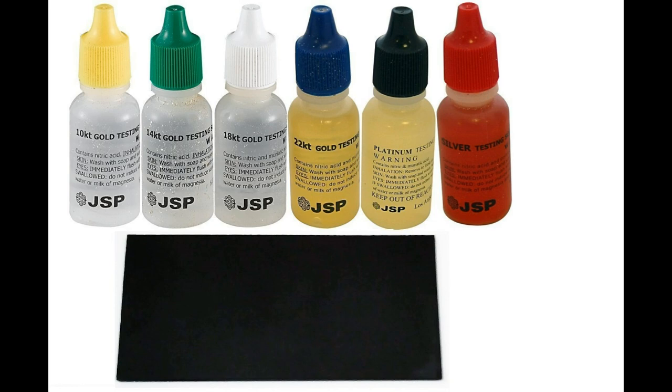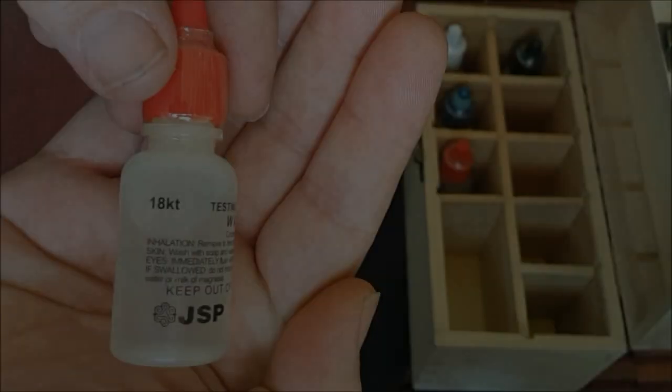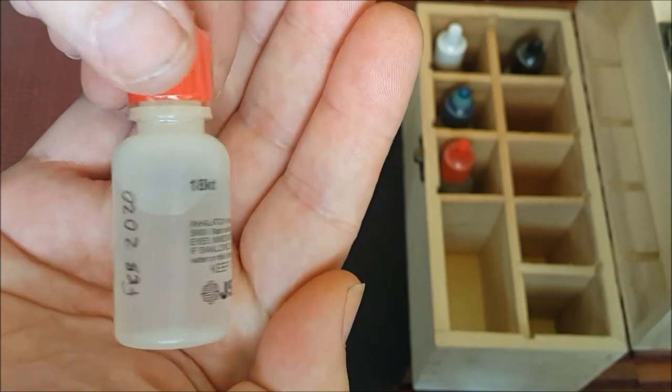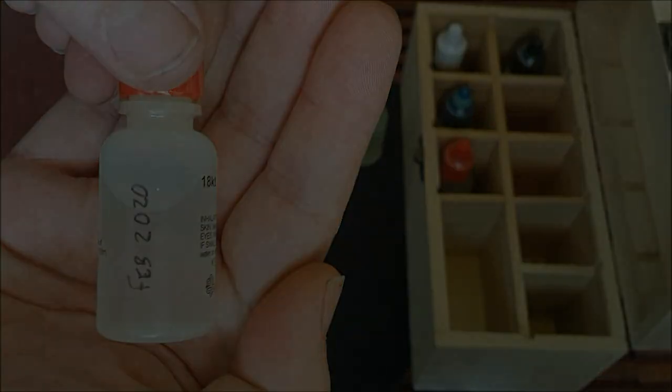You'll have a bottle for 10K, 14K, 18K, and 22K gold testing. Each bottle has a measured strength of nitric and usually muriatic acid — just enough not to dissolve the purity of the gold it was meant to test. The higher the purity, the higher the concentration of acid in the bottle. A complete kit also consists of a bottle for testing silver and platinum. I place the date of purchase on each bottle to be aware of the age of the solution, as acids will degrade due to thermal or light decomposition. This is why it's important to keep your test kits in a temperature-controlled environment stored in a container that protects it from light.